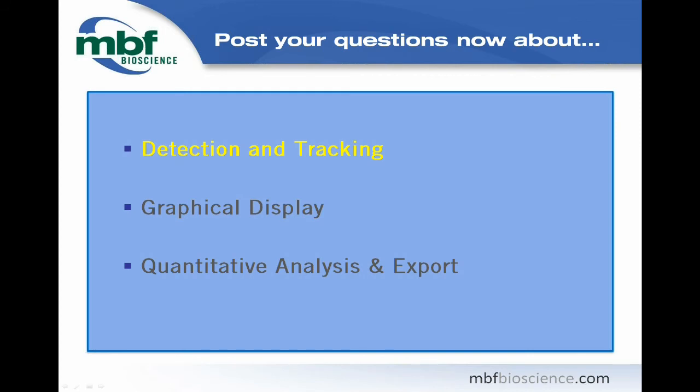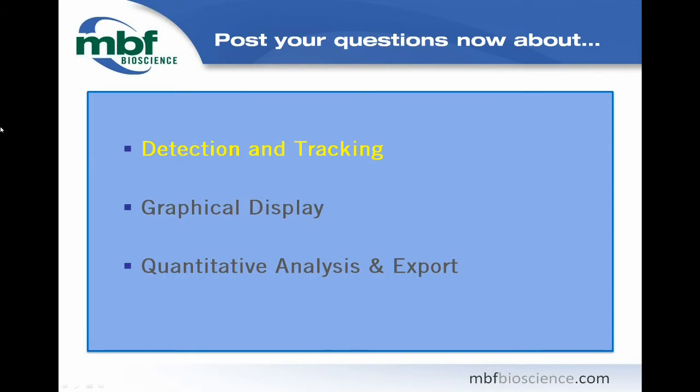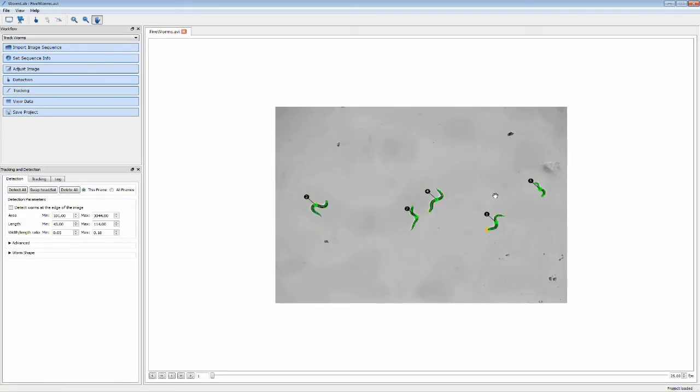We have a couple questions about what sort of data we're able to quantify from the worm tracking software. So let's look at that in detail. Let's go back to WormLab. We tracked this thing for 50 frames. I'm going to load this from scratch. We have a project where we fully track this, so all 359 frames rather than just the first 50.